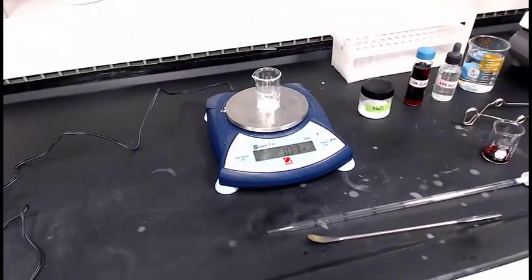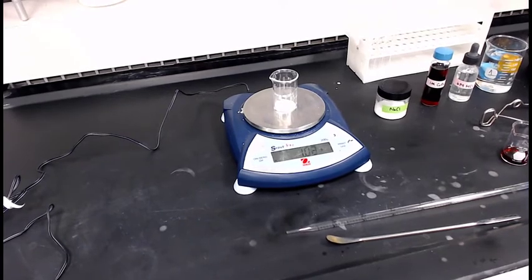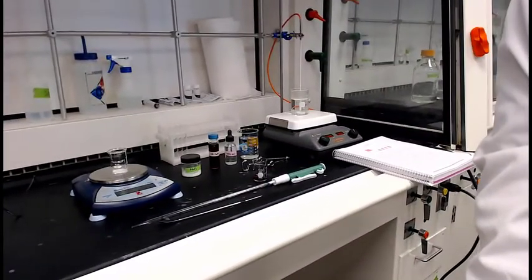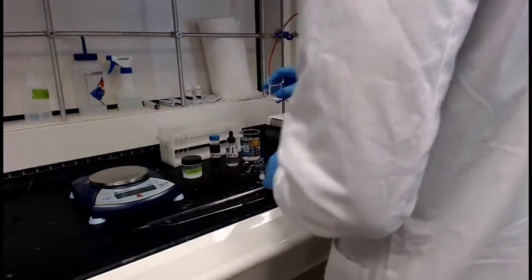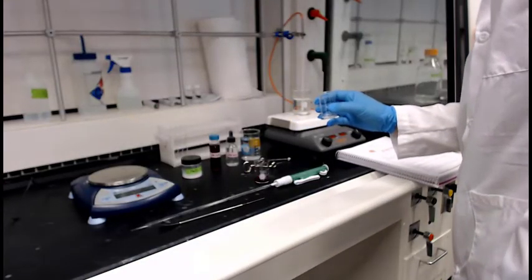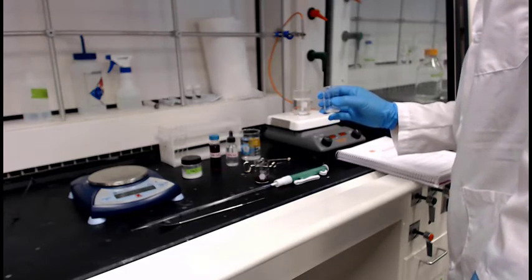Take a look at things. Okay, good. Hey, hit it right. Well, a little over 1 point. And this is good, because remember what we say, we read every digit off the face. And so when you were looking at that, you were seeing 1.00, then it kind of hit 1.01, and then it was 1.02. So that's correct, that's where it varies. All right, so let's add that to the CoCl2.